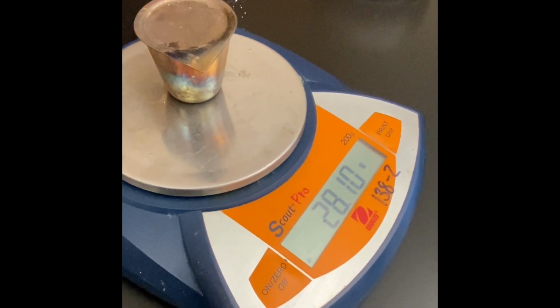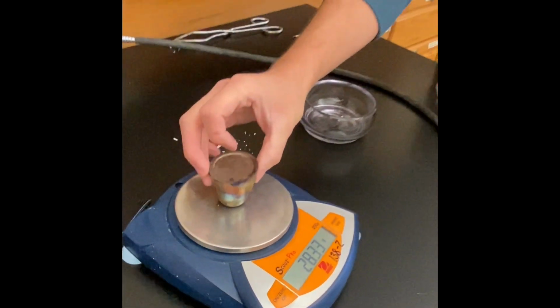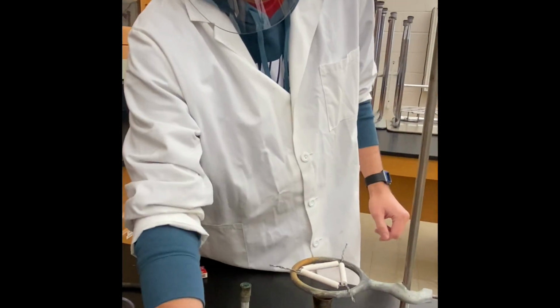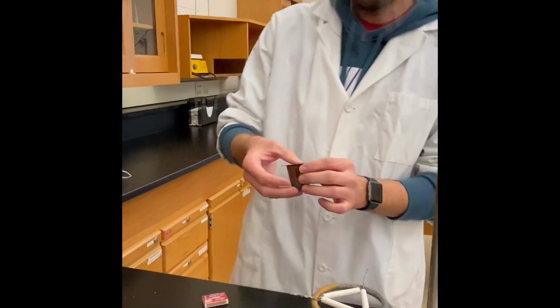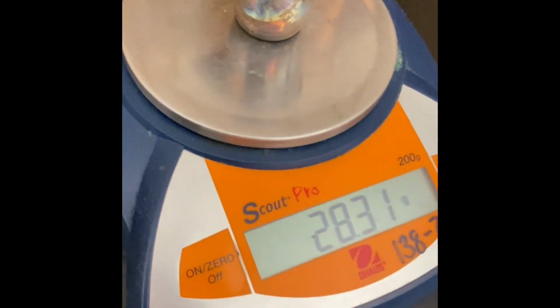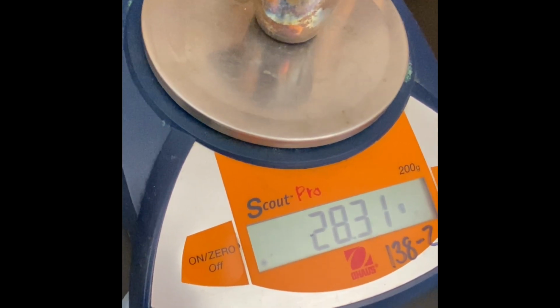The mass of the crucible is 28.10 grams. Now I'm going to add a piece of magnesium ribbon to the crucible and get the mass again so that I will be able to determine the mass of just the magnesium that I burn in my reaction. So the mass of the magnesium and the crucible with the lid is 28.31 grams.